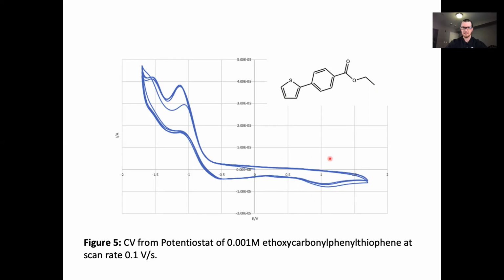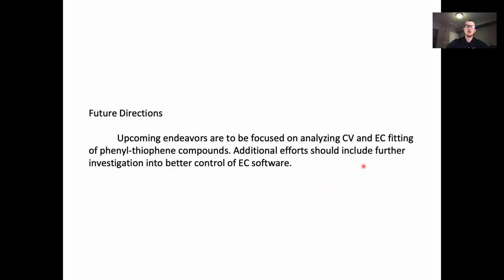We are still not seeing that reductive behavior of the irreversible part of the reaction. So it is confirming that this is still an irreversible reaction. We are not seeing the reversible behaviors in order to extract those kinetic parameters.